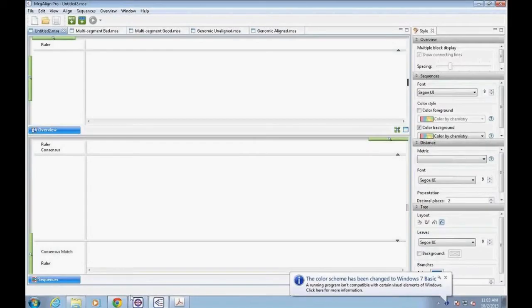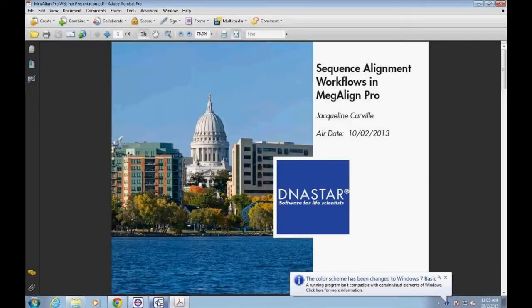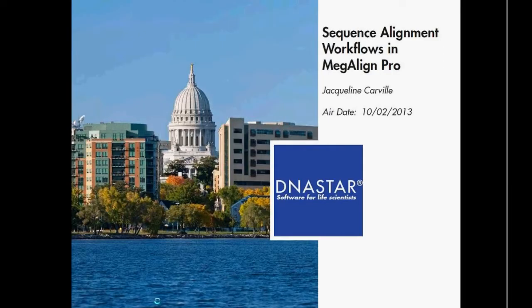Thanks a lot, Steph. So I'm just going to share my desktop here. And to get started, I'll be giving some background on DNASTAR as a company as well as MegAlign Pro itself. And then after the short presentation, I'll be getting into the software.